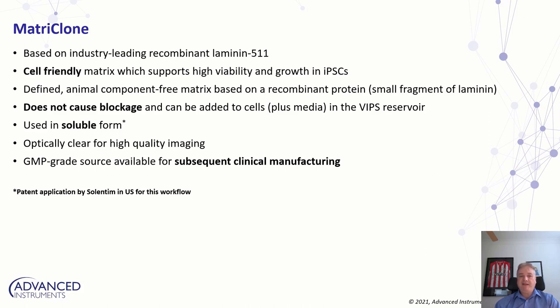So next I have a short 3-minute video from my colleague Emma Morris, and she's going to illustrate to you how practically you would use VIPS and the matriclone in your lab and how easy that is. And then I'm going to hand over to Camilla, who's going to talk about how we've been doing work to test different combinations of GMP compatible reagents, particularly dissociation reagents.